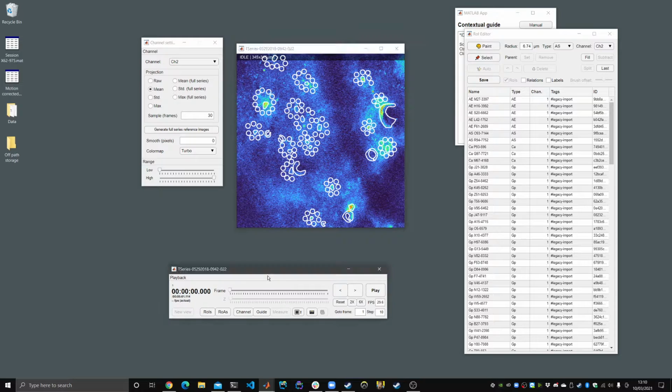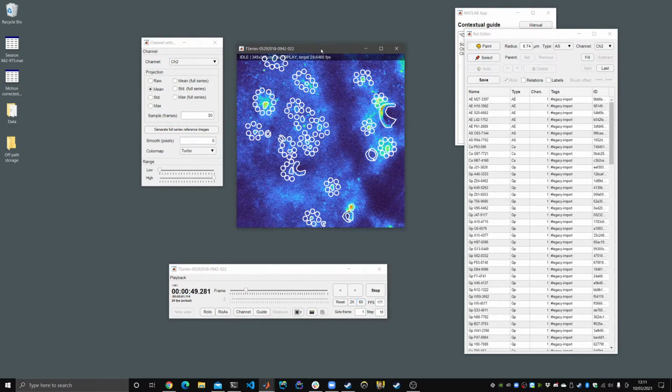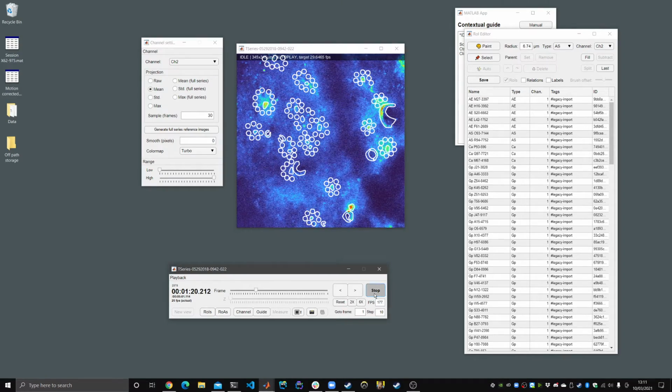This is the data. You can play back your data by choosing play here, and the data starts going. Depending a little bit on your disk, you might get a different frame rate. It's initially set to go at the same frame rate as the recording was happening on, but you can switch the frame rate manually by clicking these buttons to change the speed at which it plays back. The data is lazily loaded, so you should be able to run arbitrarily large series here. You can also scrub directly here in the data, and you can now clearly see calcium activity occurring in this data.